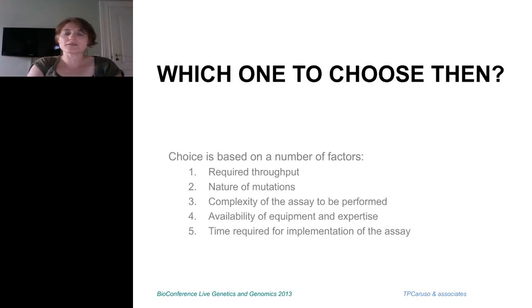So now I can kind of imagine the question out there is, so what should I use? You kind of say, this is bad and this is sometimes better, but sometimes not so good. So if you're considering a sequencing assay for your lab, you really need to answer, I think, those 5 questions, and you will be on your way to a decision.